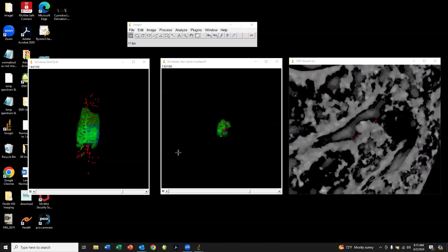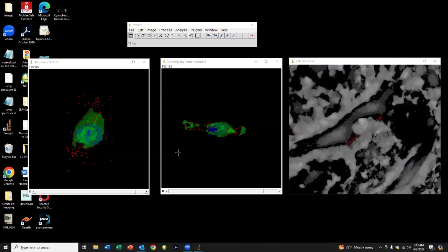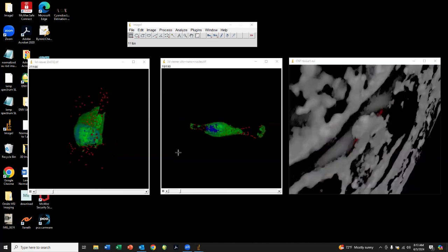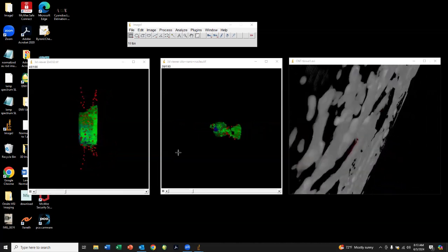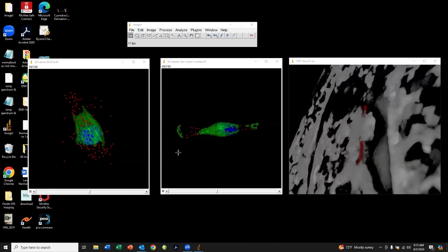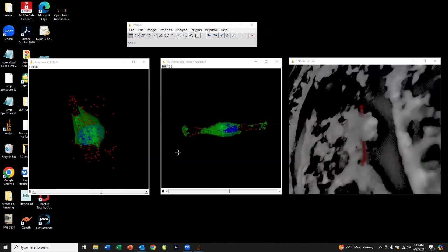the nanoparticles are located. On the right, we're showing some lung tissue, and it's lung tissue where carbon nanotubes, multi-wall carbon nanotubes, have been internalized in the lung tissue area. Here, the lung tissue is not fluorescently labeled.